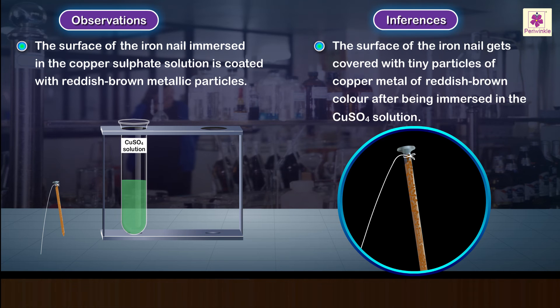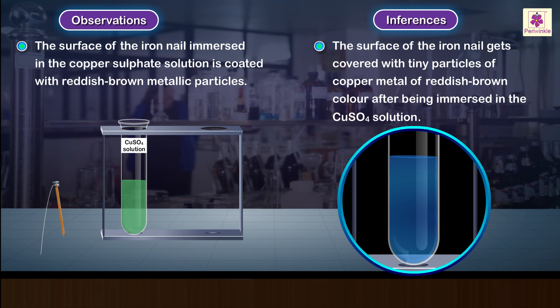Inference: the surface of the iron nail gets covered with tiny particles of copper metal of reddish brown colour after being immersed in the copper sulphate solution.